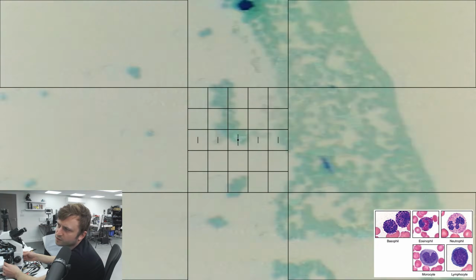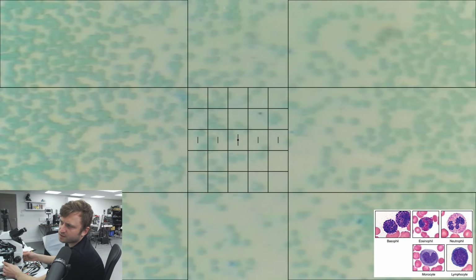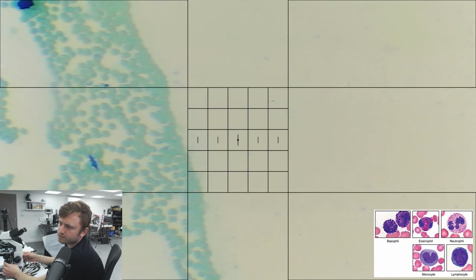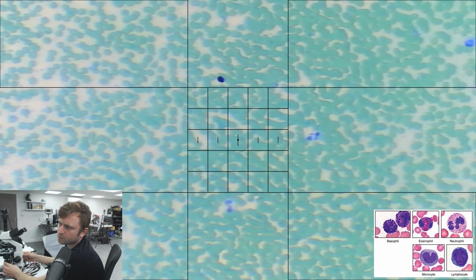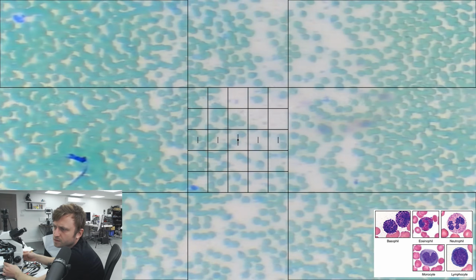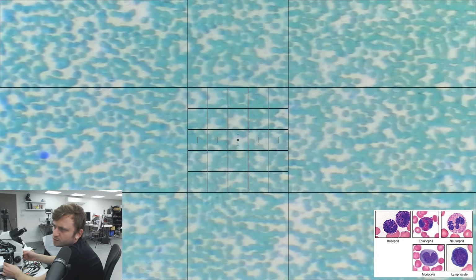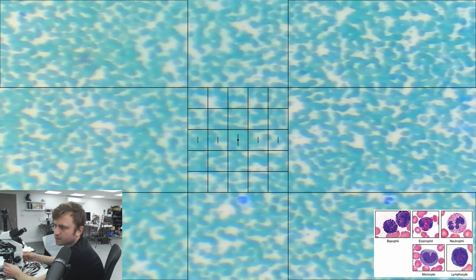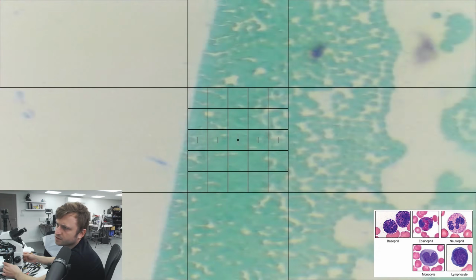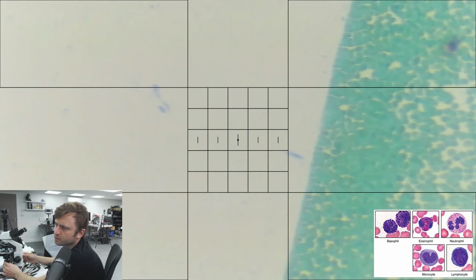Okay, so we've got this area that looks like the kind of Florida Keys type thing with a boundary between. We're going to start here, and then we're going to go right to left. What is that? Neutrophil? Obviously there are other things around it, but I'm not counting them unless they touch mine. Lymphocyte, potential debris, lymphocytes. Yeah, so there are definitely more cells in this patch. Nothing extending the edge. Okay, so from here we'll go down.